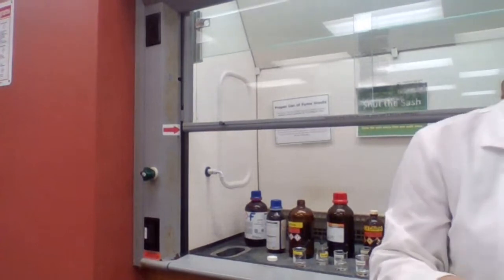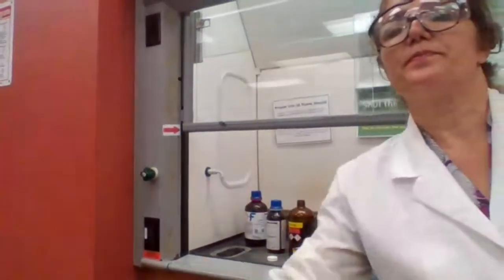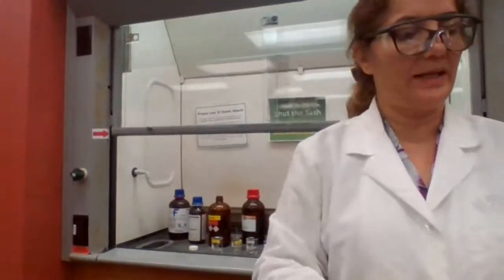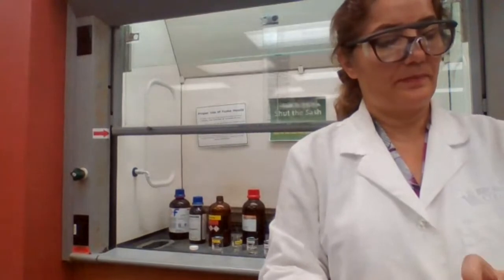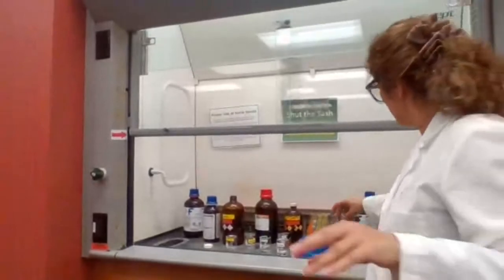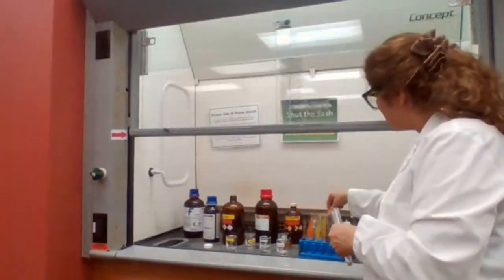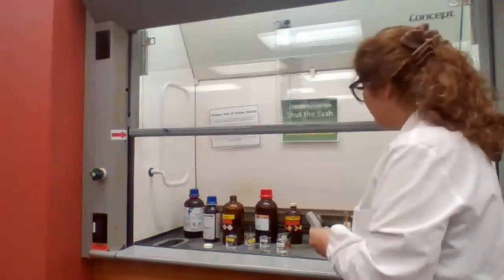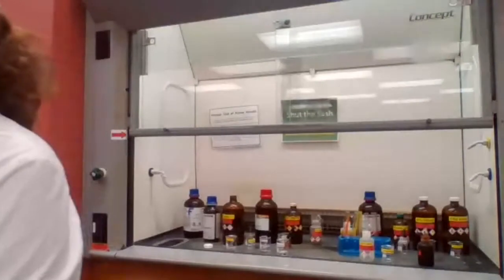Next test. What's next experiment? Chromic acid test. Chromic acid test for aldehydes and ketones. Okay. The test tubes. 1, 2. I have 2 test tubes here and 3. What is the procedure?